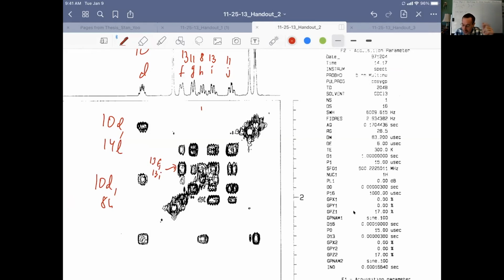That's because the J values are typically negative, whereas the vicinal couplings, the 3-bond couplings, slant in the other way because they're typically positive. We have the same thing over here. What I'll often do is just abbreviate these 11X to mean it's 11 crossing with itself. It just saves a little bit of space.